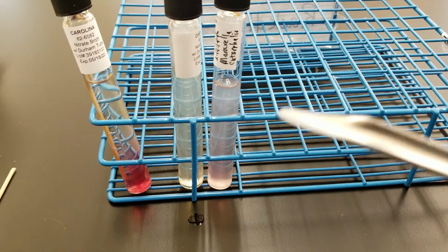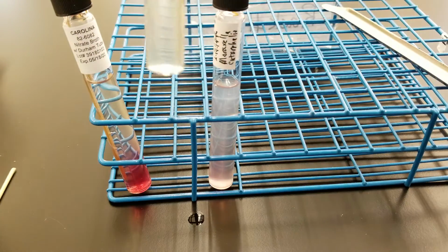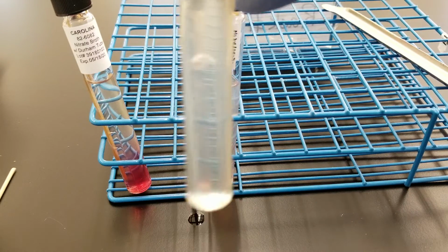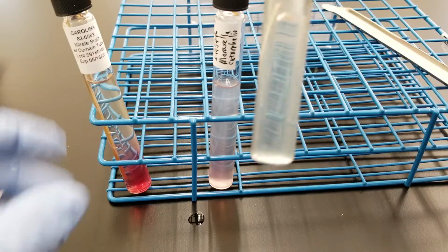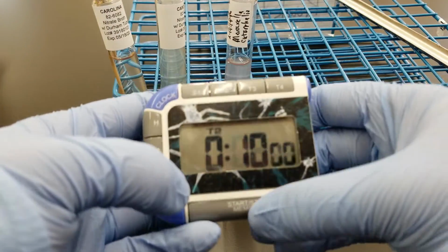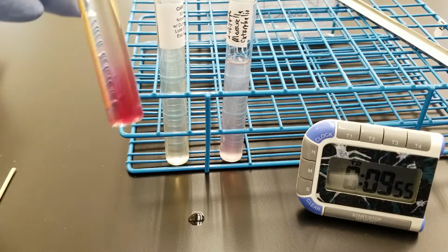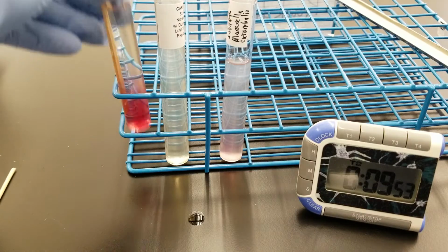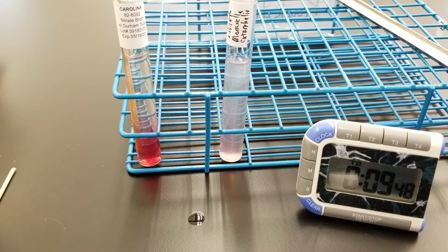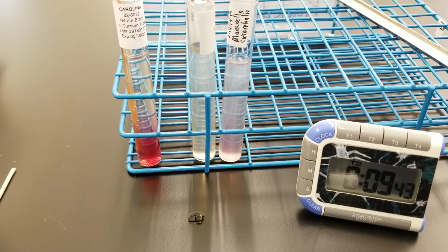All right, so closing everything. Now we're gonna see if this guy is gonna turn red too, or pink. All right, so we're going to use the up to 10 minutes, okay? We see that the other one, the negative control, is already turning negative. All right, we'll see. I'll come back in a minute.